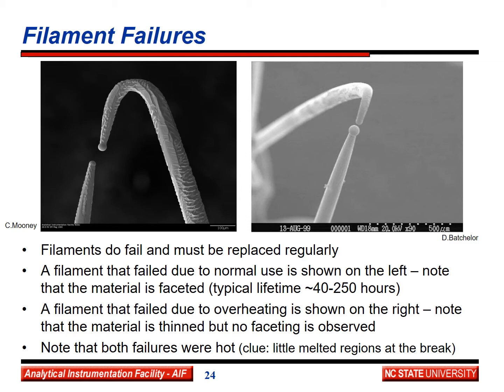Both of these failures were hot, and we can tell that because we've got a little molten ball at the end. If you have a cold failure, then you'll have a fracture surface.